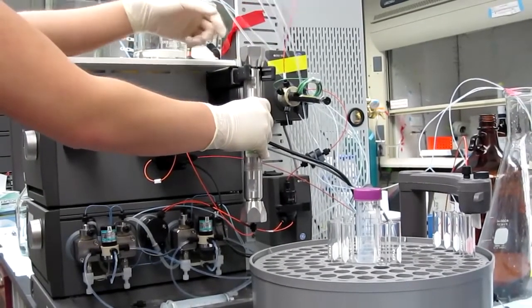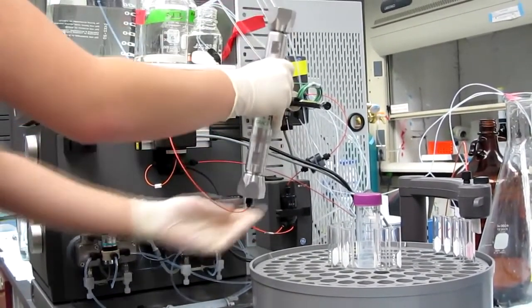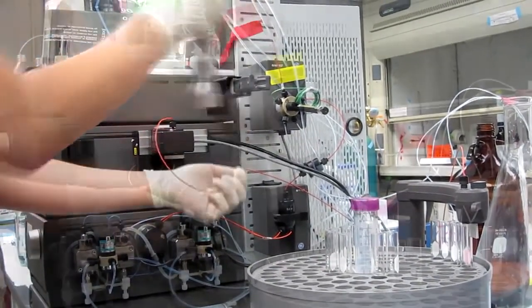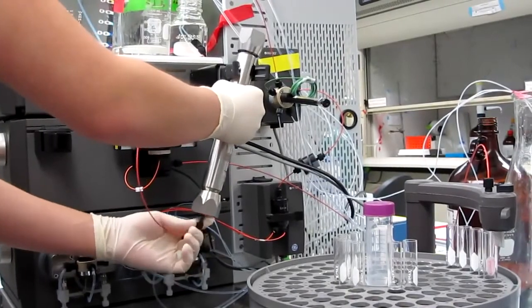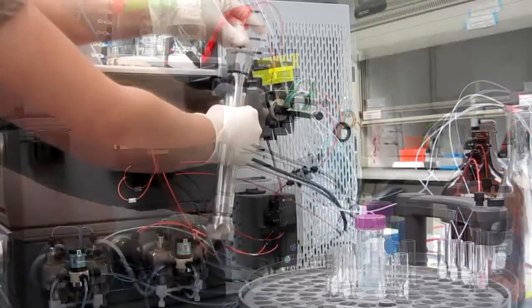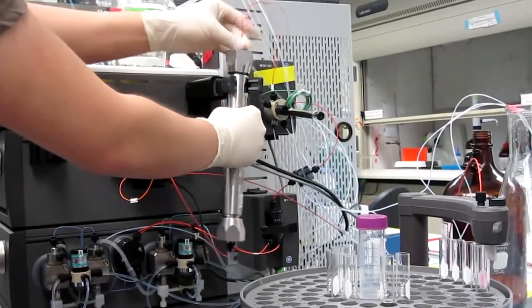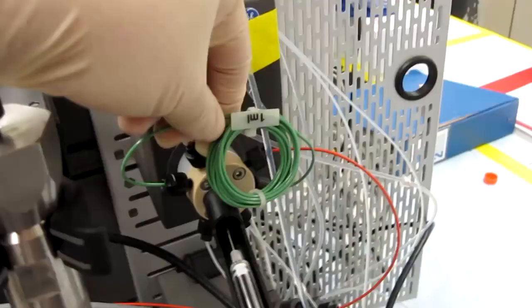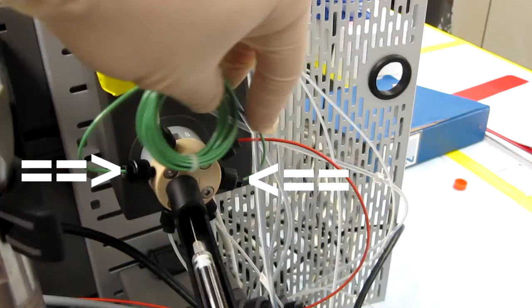To switch to a desired column, unscrew the plastic screws on the top and bottom of the column attached. Then simply attach those screws onto the desired column. The sample loop can also be switched out to the desired volume. In this case, the 1 ml sample loop is attached and can be changed out by unscrewing the plastic screws on either side.